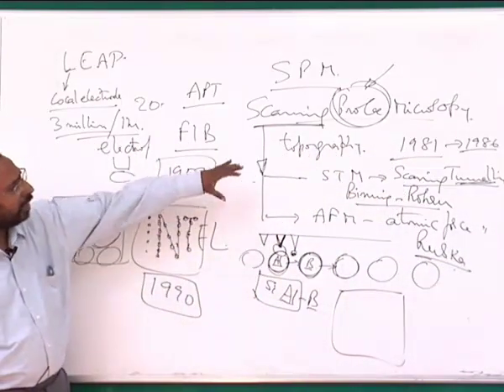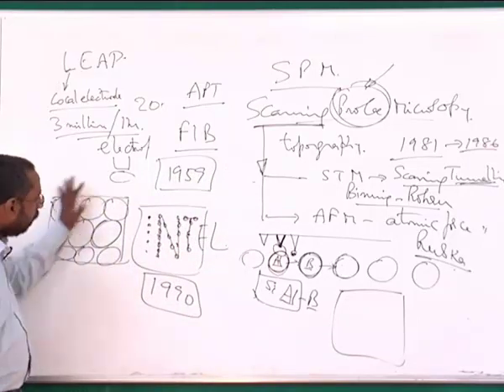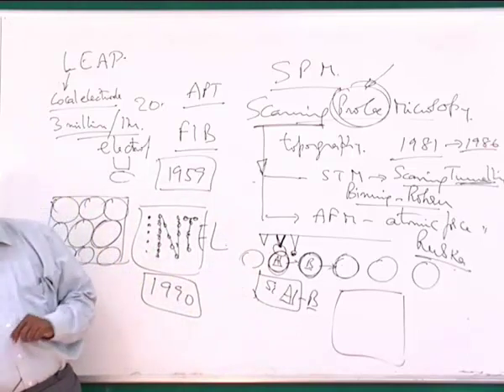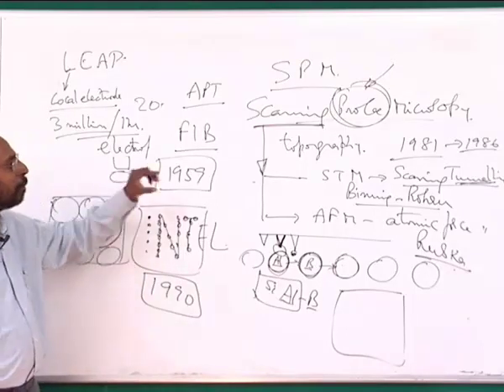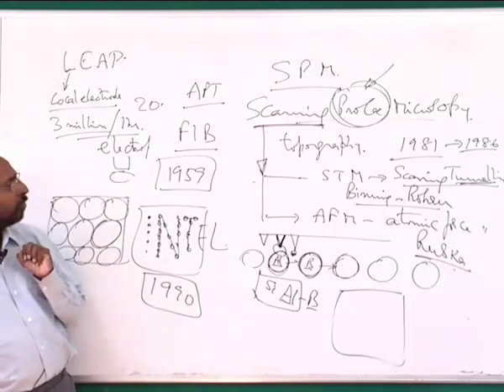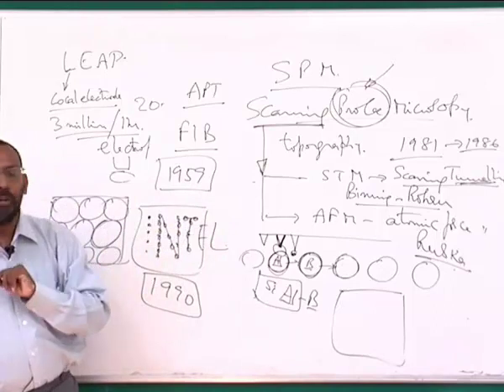So you can see the scanning tunneling microscope is a fascinating tool which can not only image the surfaces, but can also create features. You are able to use this kind of fine forces between a probe and the atoms, and even lift atoms and manipulate them into various structures.